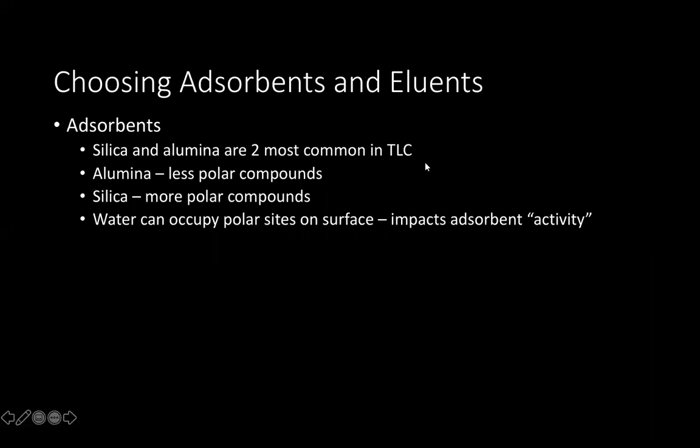For the most part, in organic lab, there's a decent amount of instruction given with regard to adsorbents and eluents for conducting your TLC plates, especially in this lab since you're just learning the technique for the first time. There are, however, different adsorbents and eluents that can be used. In terms of adsorbents, there's silica, which we'll be using in this lab, and also alumina.